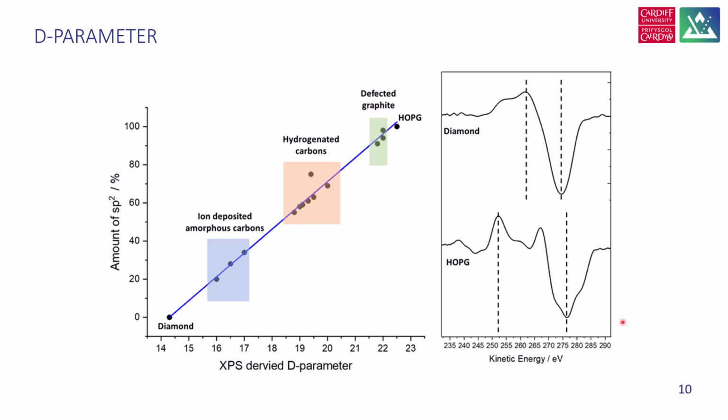One useful thing when recording carbon spectra is to also record the carbon Auger. Carbon Augers, well, Augers in general, are very chemically diagnostic, because they are a 3-electron process. The transitions that occur in that 3-electron process are dominated by changes which have happened in both initial and final state of the carbon material, or any material in general, if we're talking generically about Augers.